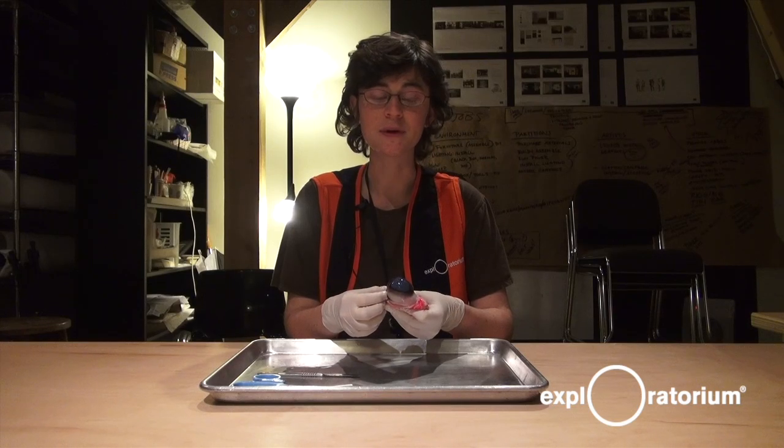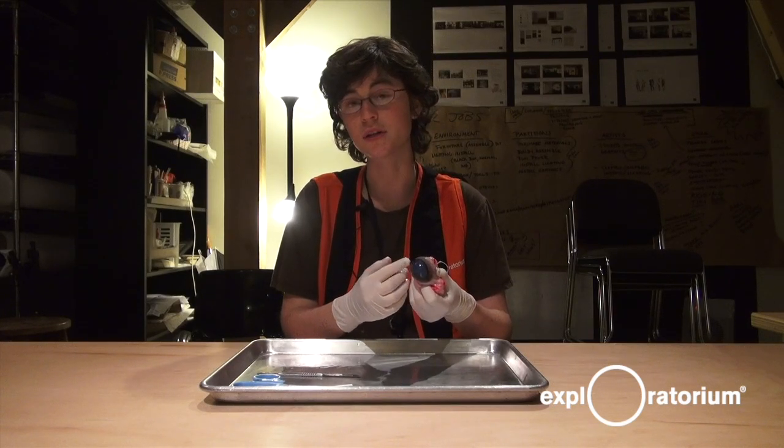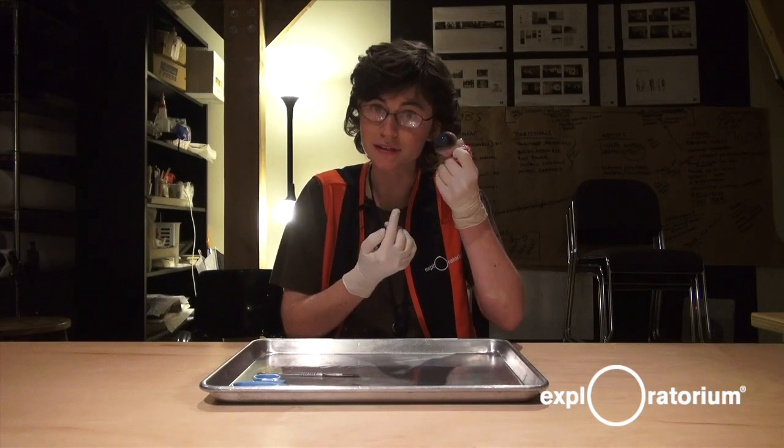One of the biggest differences between a cow eyeball and a human eyeball is the size. Cow eyeballs are two to three times bigger than the average human eye, as you can see here.